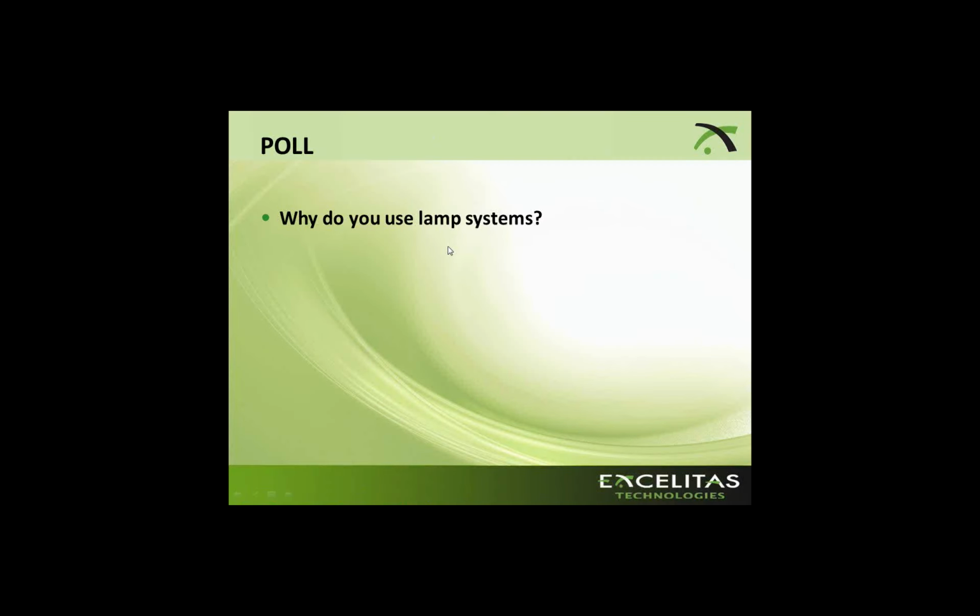So a little bit about stability. When you're talking about stability, you're talking about temporal stability, so between your exposures, between your experiments, or over the entire lifetime of your bulb or LED. With most experiments, chances are you're capturing more than one image. Therefore, with a lamp, you have the lamp on the entire time, and you're physically shuttering every time the camera takes a picture. So how do you know that your lamp is stable between the different exposures?